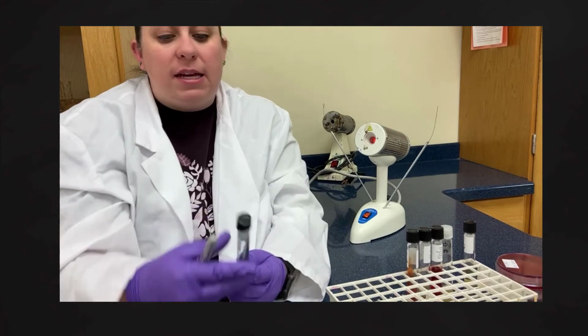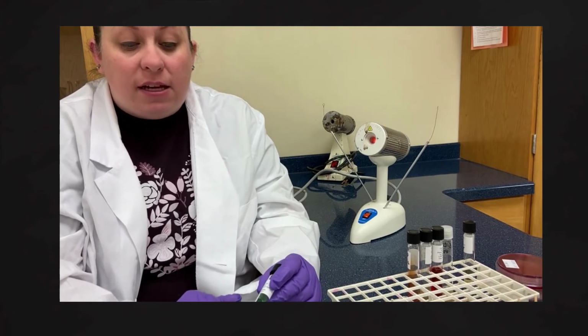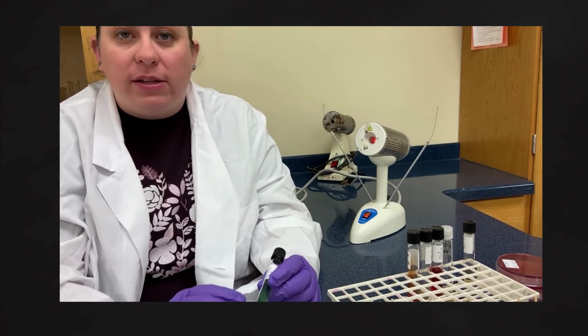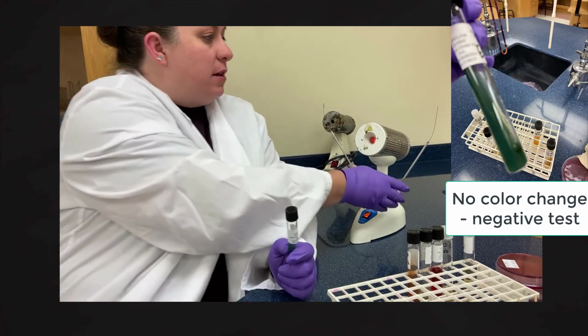And last but not least, we're going to end up doing the Simmons citrate agar, and this, we're going to see if it can utilize the citrate that's in here in that citric acid cycle known as the Krebs cycle. And so we're going to look again for a color change. We're also going to do the deep like we did before, and then scratch the surface.